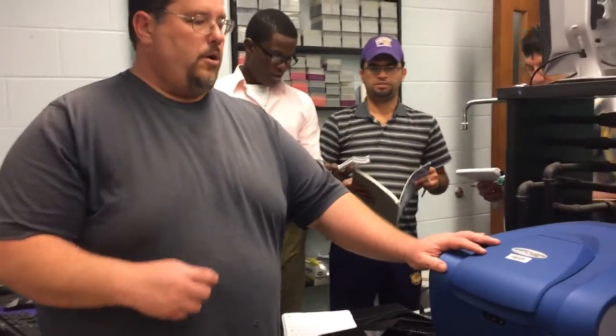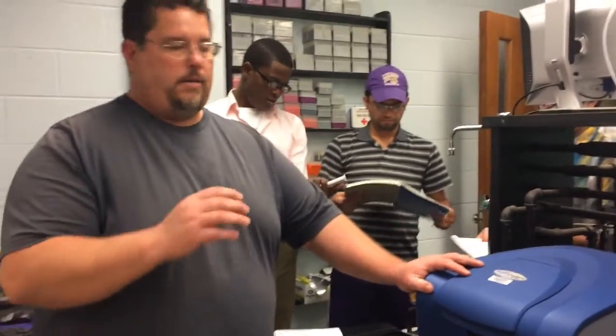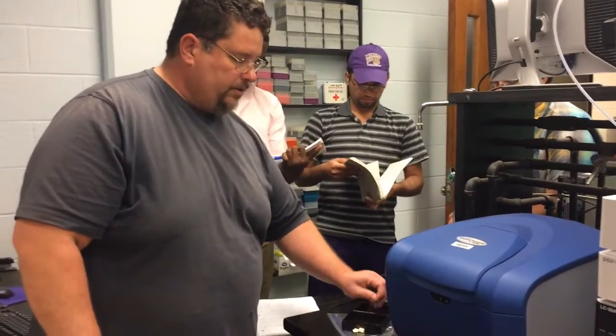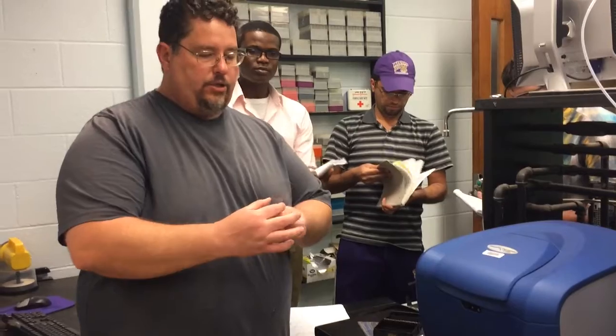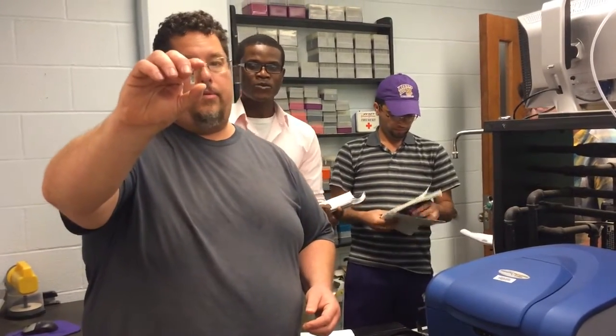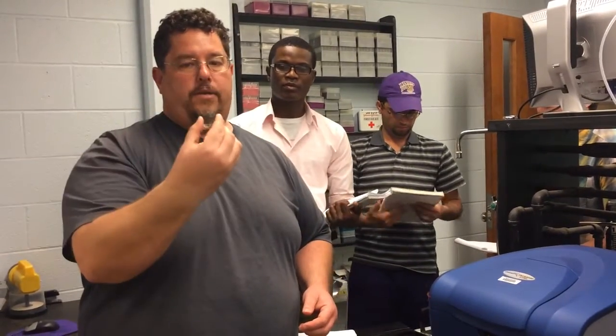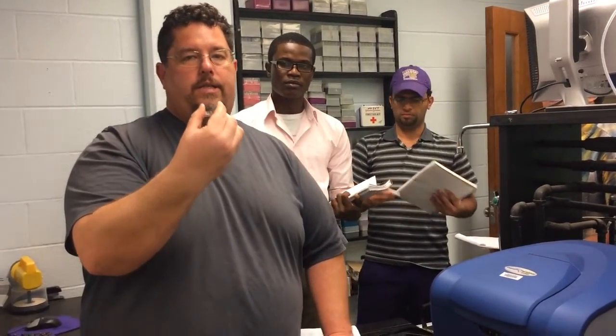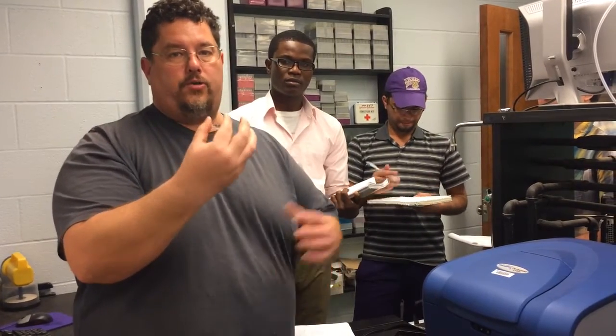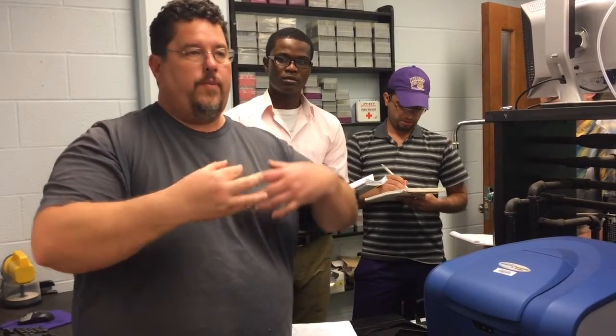Okay, so anyway, so here's a microarray chip. This looks like a normal glass slide, but on this slide is literally tens of thousands of genes that we can screen to figure out what genes are turned on in various types of experiments.